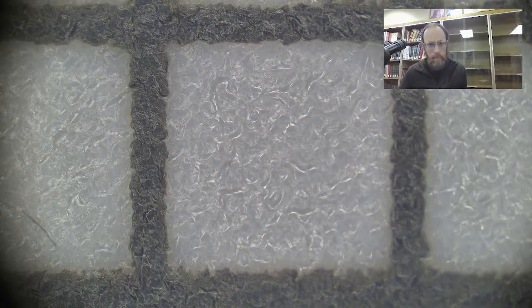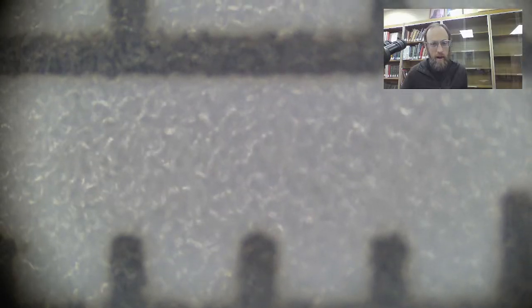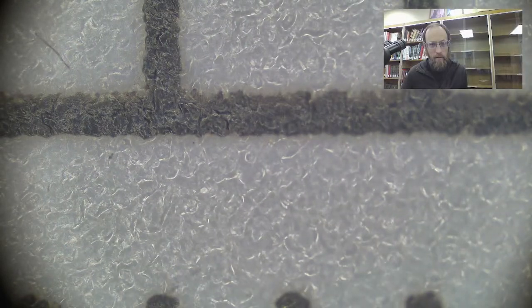And if we go there, that's 1 millimeter. So maybe it would be handy to have just that as a rough guide, maybe toward the bottom.